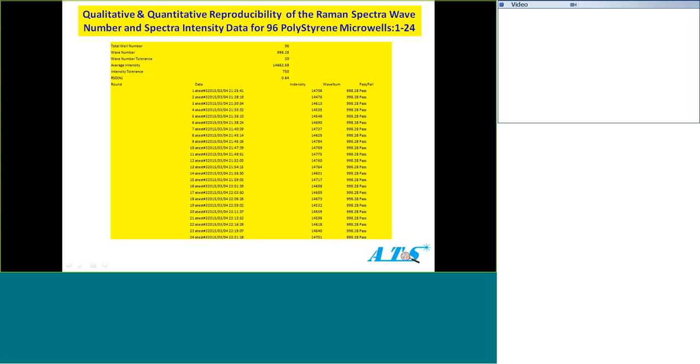And then this is the intensity, 14,706. If you look at the average, 14,662.59, and we are at about a 2.5% marker there, and we only have 0.64% error. So this is fantastic, okay? And of course, the tolerance is better than 0.64%. So if you have a 10% marker here for the rejections, then of course everything passed. So you can see they are passing. Even if we set it at 2%, all of them pass, because this is flat and solid, ceramic, I mean polystyrene.